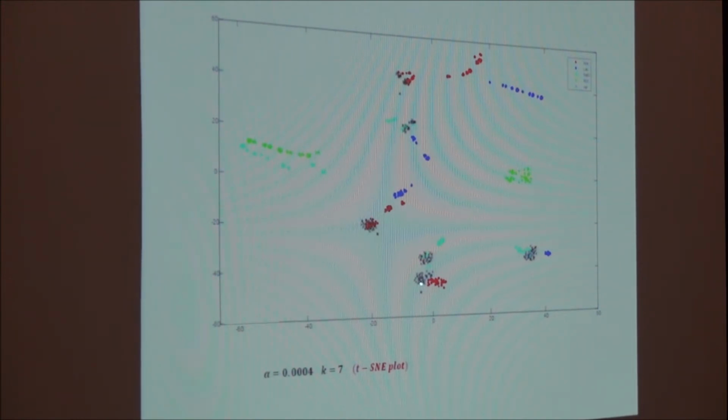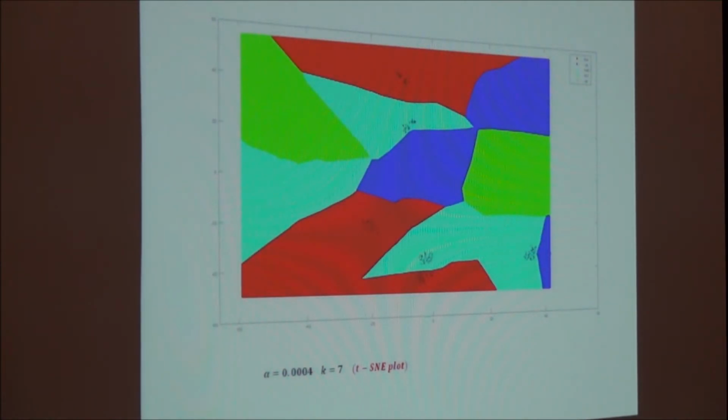You can see by way of nearest neighbor classification where those black crosses belong. So you could have color-coded boundaries, and you can see where the validation unknown samples fall. And it was very effective. And how we could detect below the limit of detection is something we can discuss. I think you can't do it, but because there were flaws in the experimental design, we took advantage of those to be able to do that.